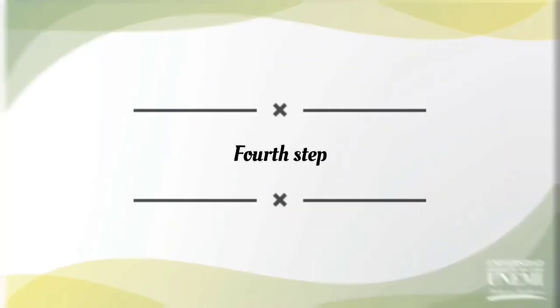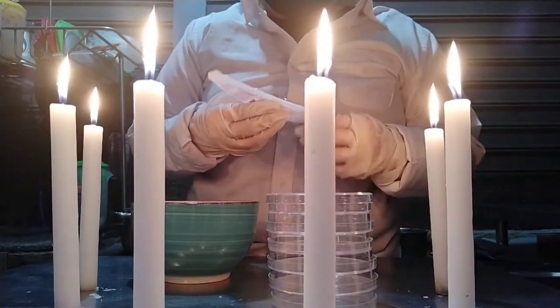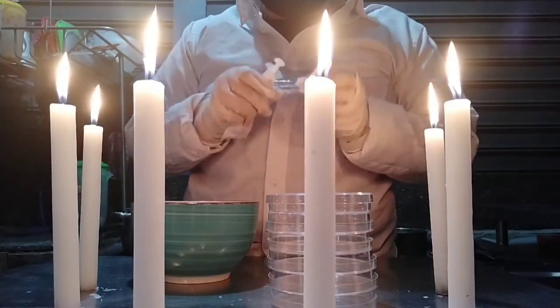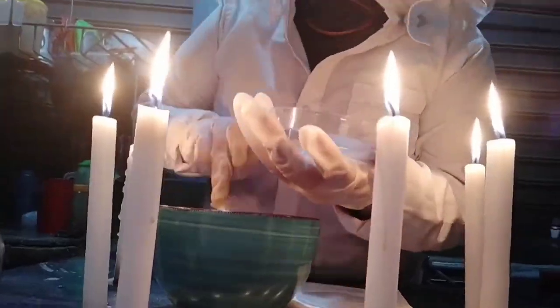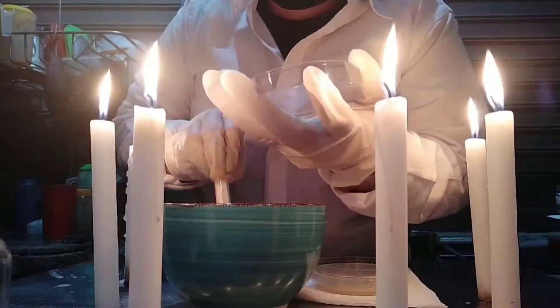Fourth step: in this step we are going to need our six petri dishes, our culture medium, and syringe. Next, we are going to put our culture medium into the petri dishes.